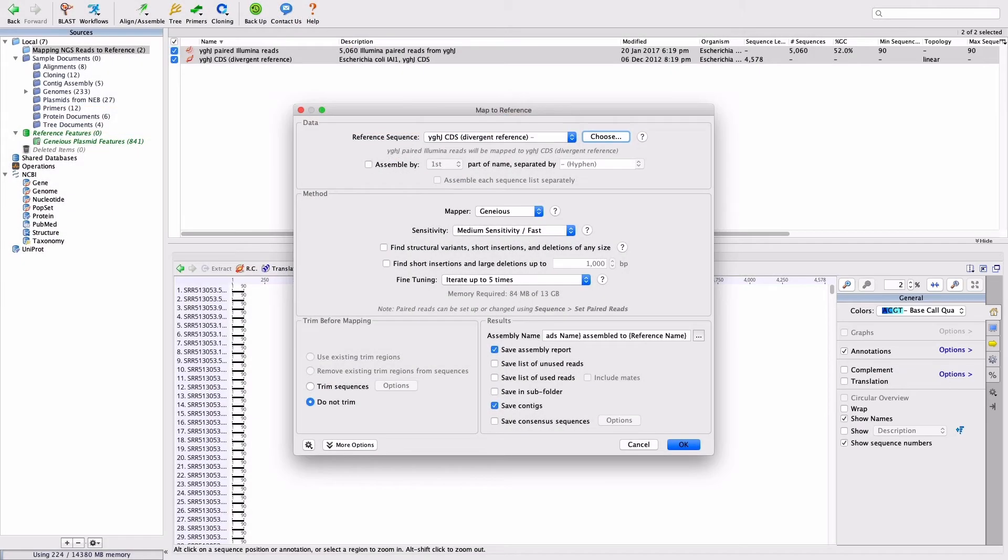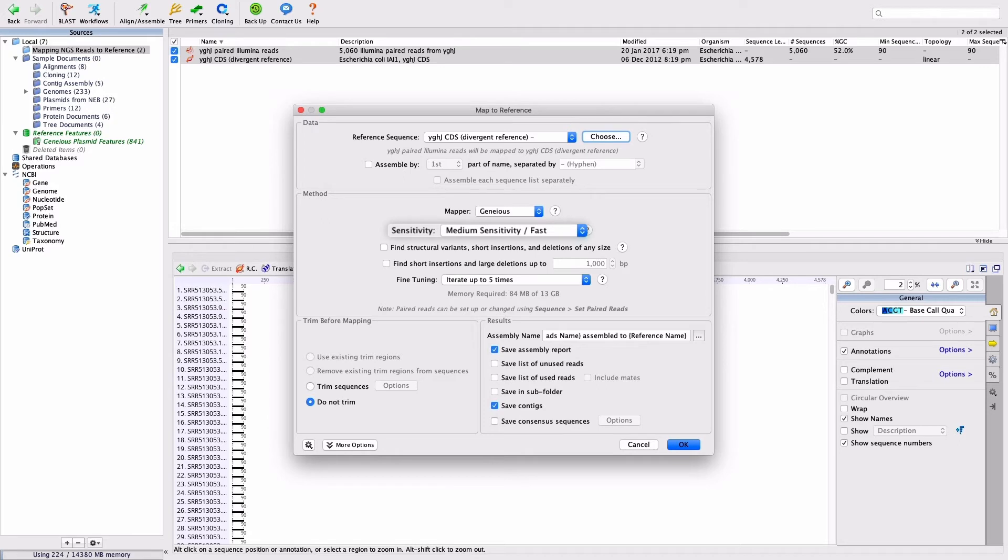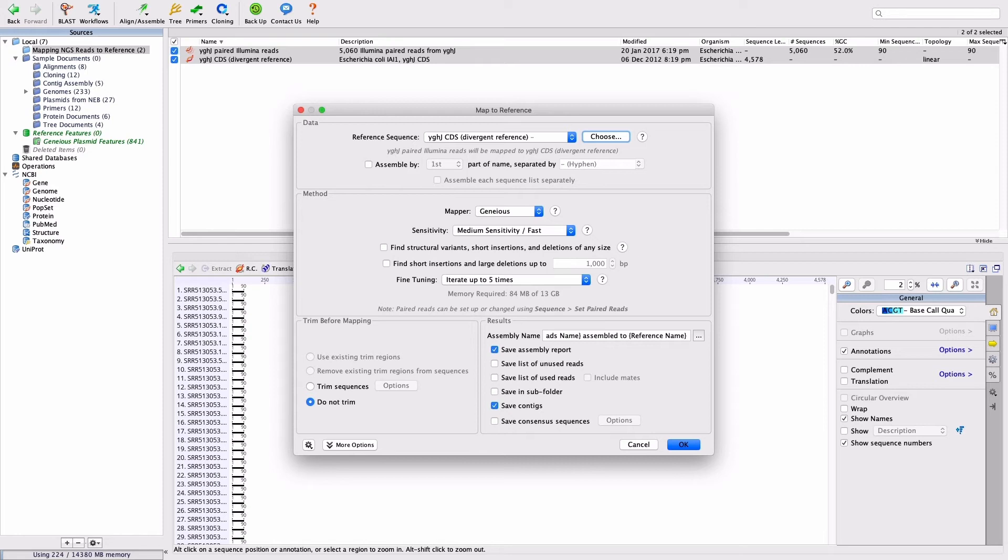Genius will automatically choose an appropriate sensitivity based on the size of your dataset. In this case, the sensitivity is set on medium sensitivity slash fast. For next-generation sequencing, medium or medium-low sensitivity is recommended, as using high sensitivity will take a long time, and is unlikely to improve the results if you have sufficient coverage.